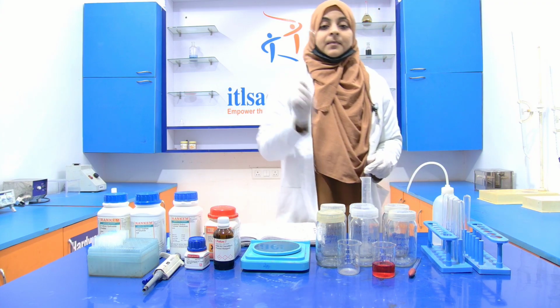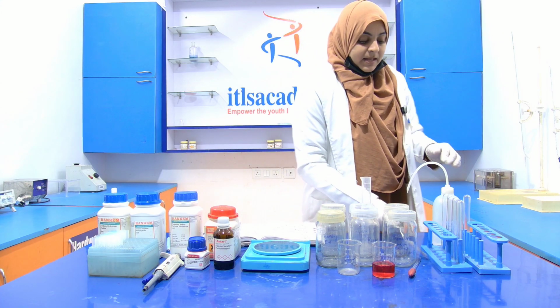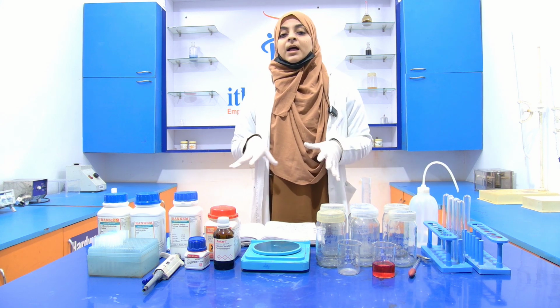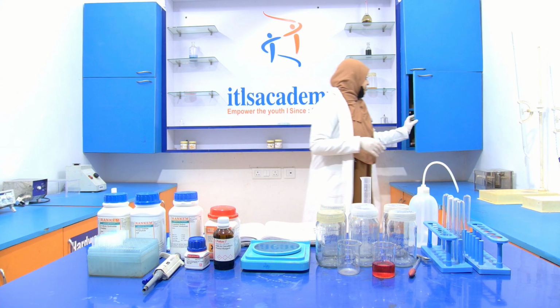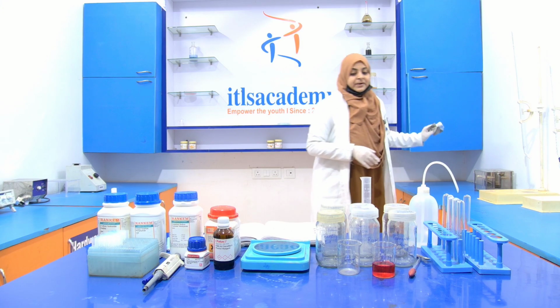This is our spatula for the measurement of the chemicals. This is distilled water. Now, with the help of these chemicals, we have to prepare the reagents. So let's start the preparation of the reagent.